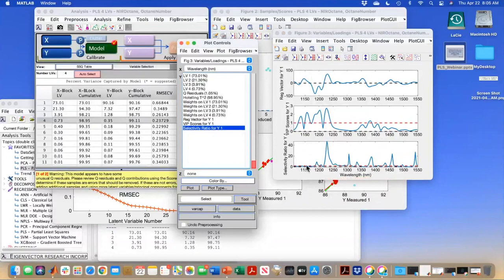And this is one way to do a variable selection, and this is another one. And it's interesting often to do them together to say, aha, these look like they're the most important variables here. Maybe these guys over our limit line. But it's a little different from what this approach uses. And so understanding a little bit of how the variable selection is working is sometimes tough, but it'll help you interpret these plots better. And we also have a webinar on variable selection.